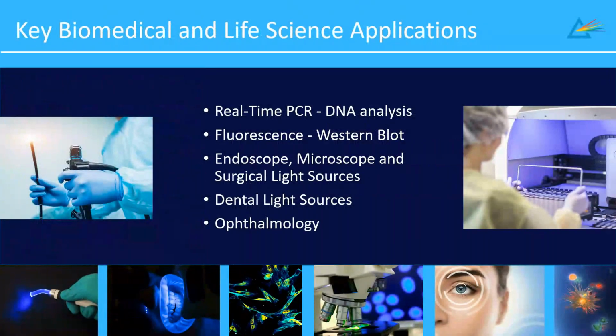Biomedical illumination systems are used across a remarkably broad range of instruments and imaging modalities. In some applications, illumination is used primarily to generate analytical information, such as fluorescence measurements in PCR systems, protein analysis in Western blot imaging, or quantitative measurements in spectroscopy and molecular diagnostics.